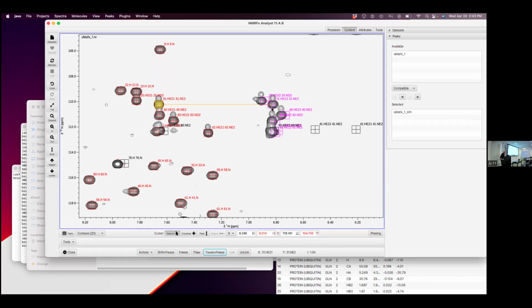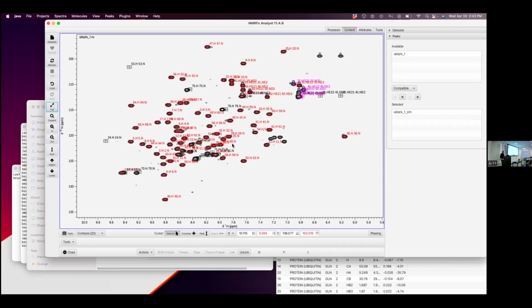And the little shoulder on top, you know what that is? That's the NHDs. Yes. The isotope. Actually, in a nitrogen frozen, the NH2s are suppressed. All you see is the NHD.